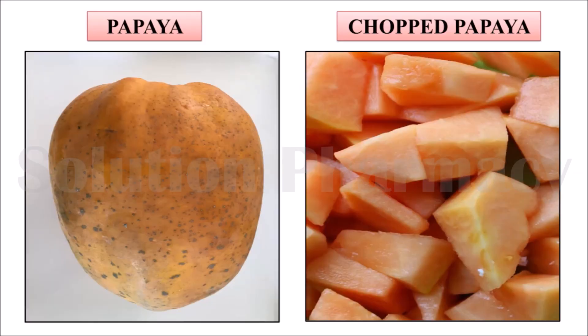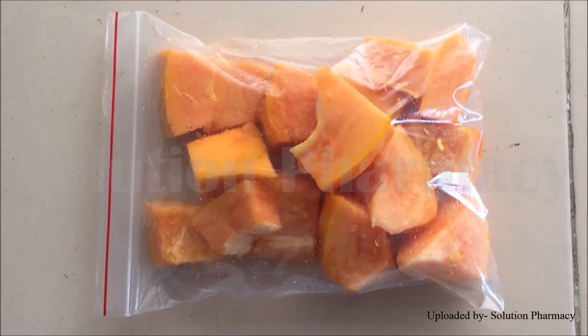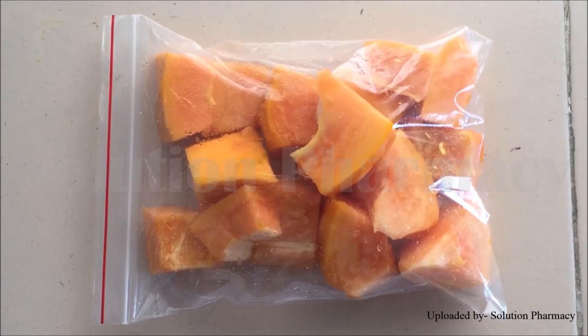First of all, remove the outer surface — the peel — of the ripe papaya, and then chop it into small pieces. Now transfer these chopped papaya pieces into a deeper poly bag and zip it.